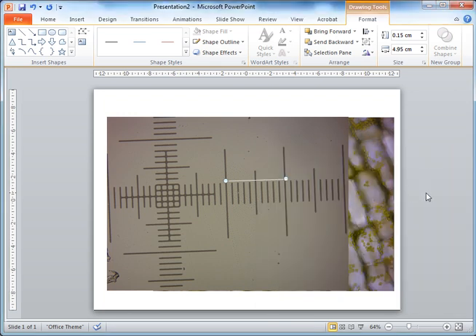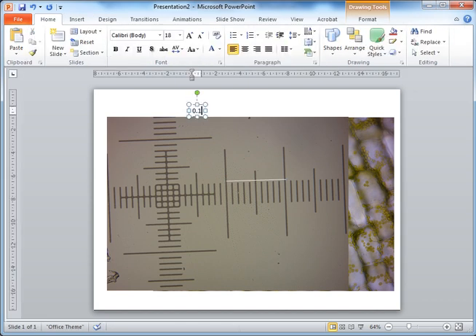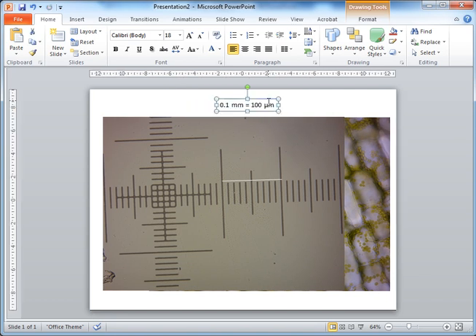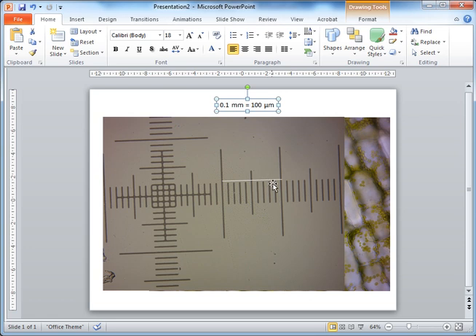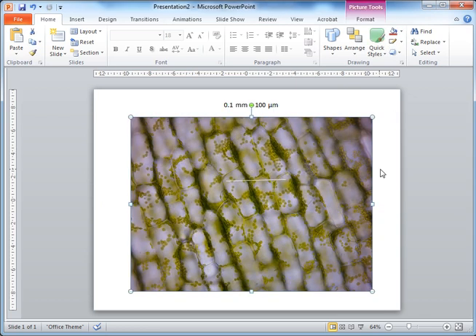So 4.95 centimeters in this PowerPoint image is equivalent to a real-life size of 0.1 millimeters. And 0.1 millimeters is equal to 100 micrometers — let's note that down. Now that we know 4.9522 centimeters on PowerPoint equals 100 micrometers in real life, we can delete the calibration image and start working with our actual biological image.